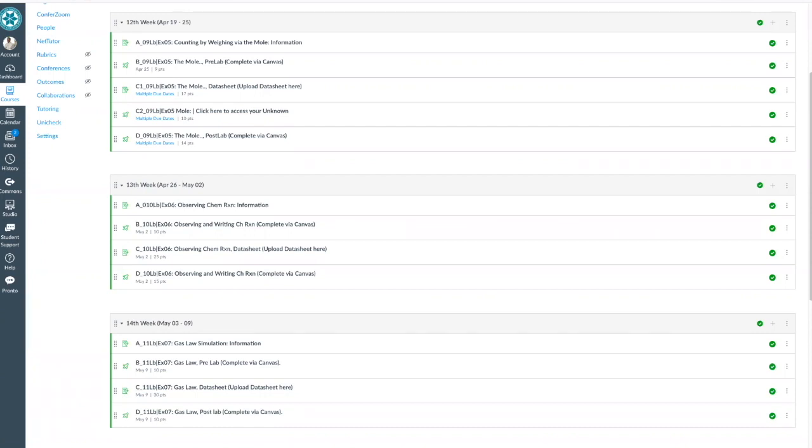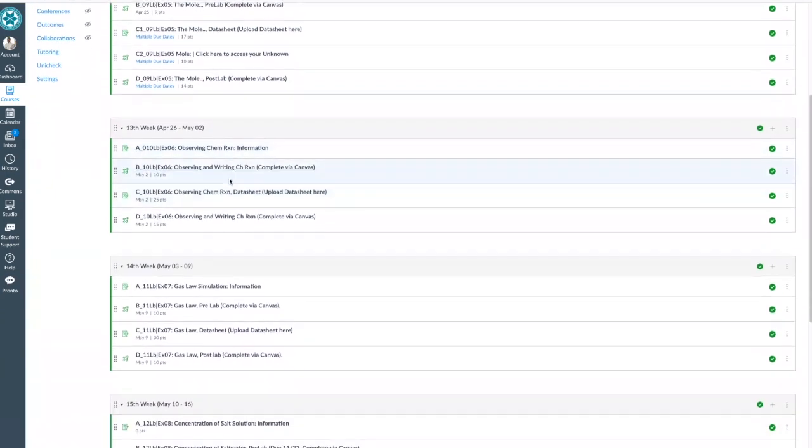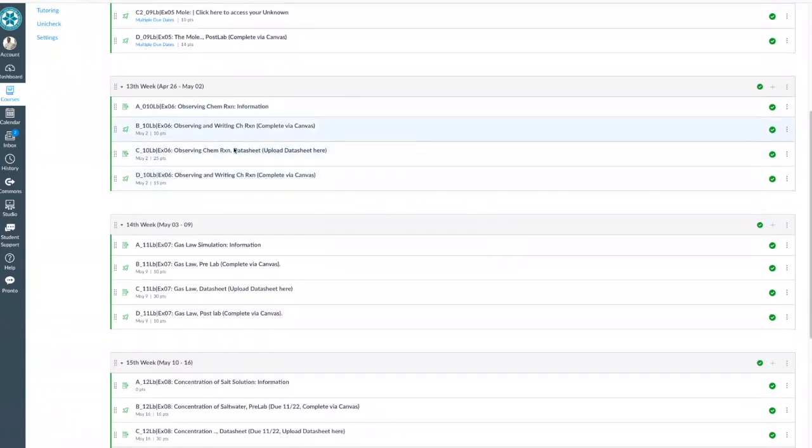So what I would like to do again is just go over the lab, make sure you understand what to fill out, and then give you a small demo of some of these procedures. So first, you guys are going to find that particular experiment on week 13. I can't believe we're in week 13, which means we only have 3 weeks left after this week. Okay.